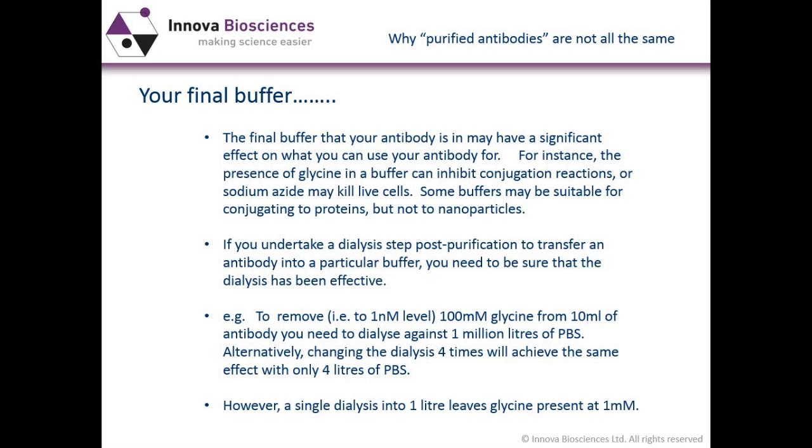Just to give you an example of how to ensure that dialysis is effective, we're going to take an example where you've got 10 mls of antibody and it's in a buffer containing 100 millimolar glycine. You want to effectively remove that glycine altogether, and by altogether here I mean glycine down to a level as low as 1 nanomolar. If you want to do that in one step, you have to dialyze your antibody against 1 million litres of PBS, and I'm absolutely certain none of you want to do that.